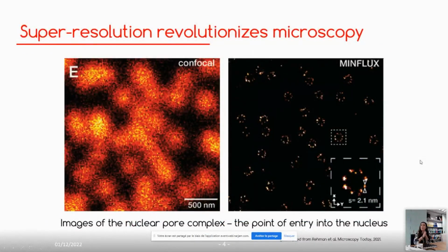And being able to see in super resolution has been a recent development, in terms of the history of microscopy. For hundreds of years, we've had microscopes available to us to see things that we couldn't detect with the human eye. In particular, these structures that you see here on the confocal image as blobs are called nucleopore complexes. And the nucleopore complex, or NPC, has been a very hot topic in super resolution microscopy because super resolution, for the first time aside from electron microscopes, was able to really redefine and pinpoint this structure.